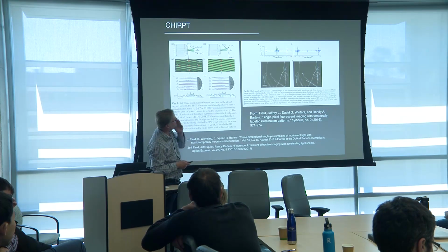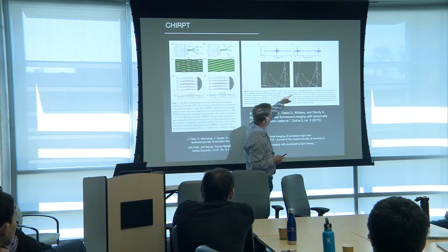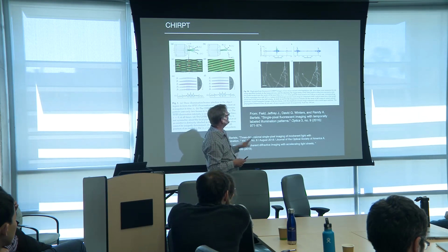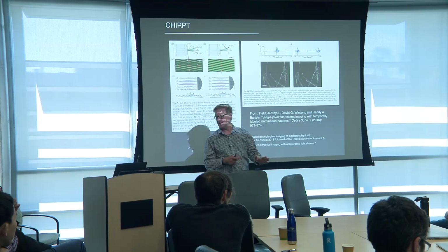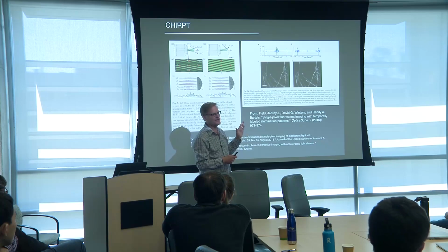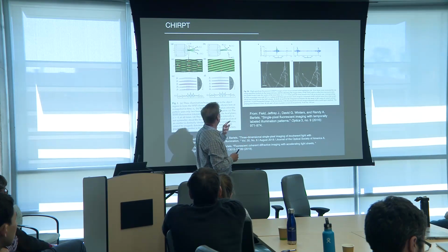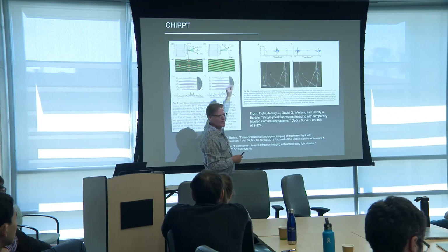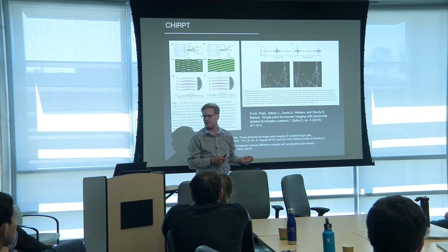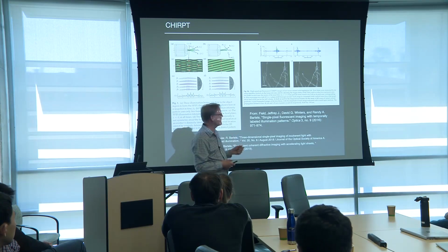And to show how well it works, they took some simple lens tissue and dyed it. They've done 2 photon imaging here, but completely out of the focal plane of the system. Because they can measure the phase of these input beams based on the modulation of the fluorescence, from this incoherent signal, they can then basically do holography with it.